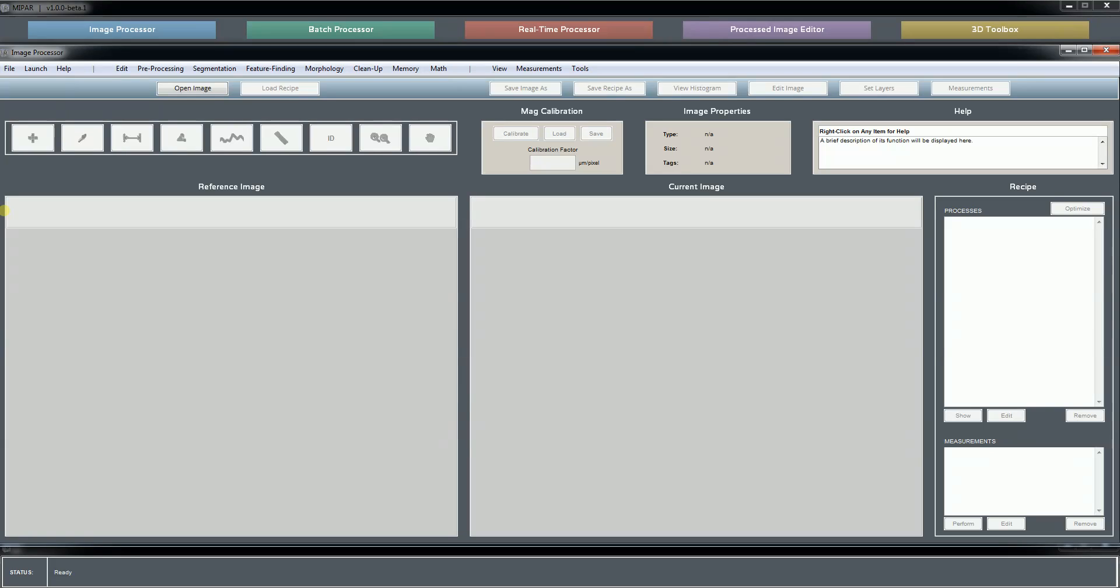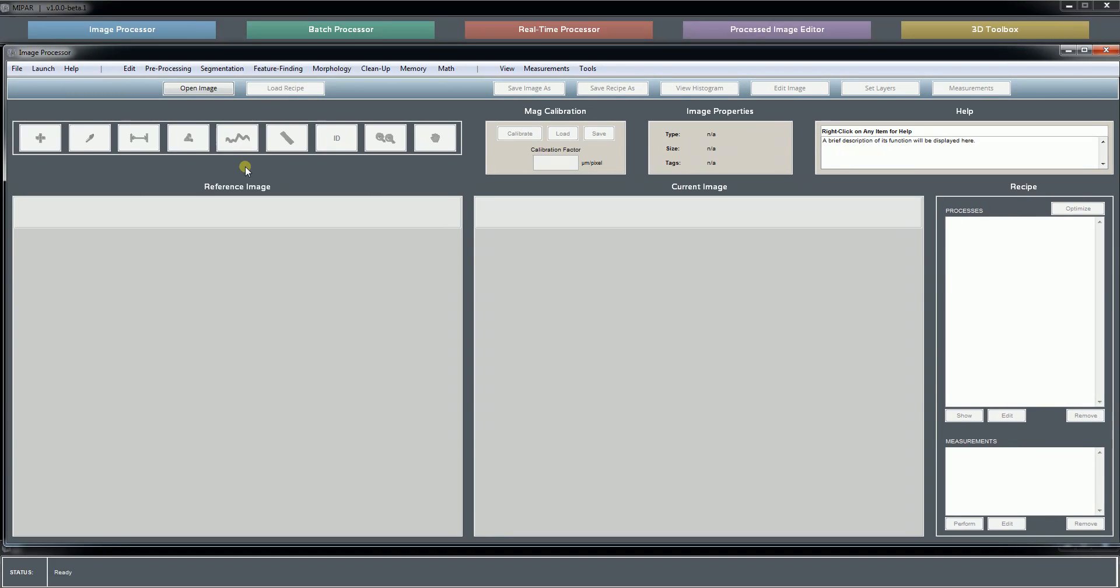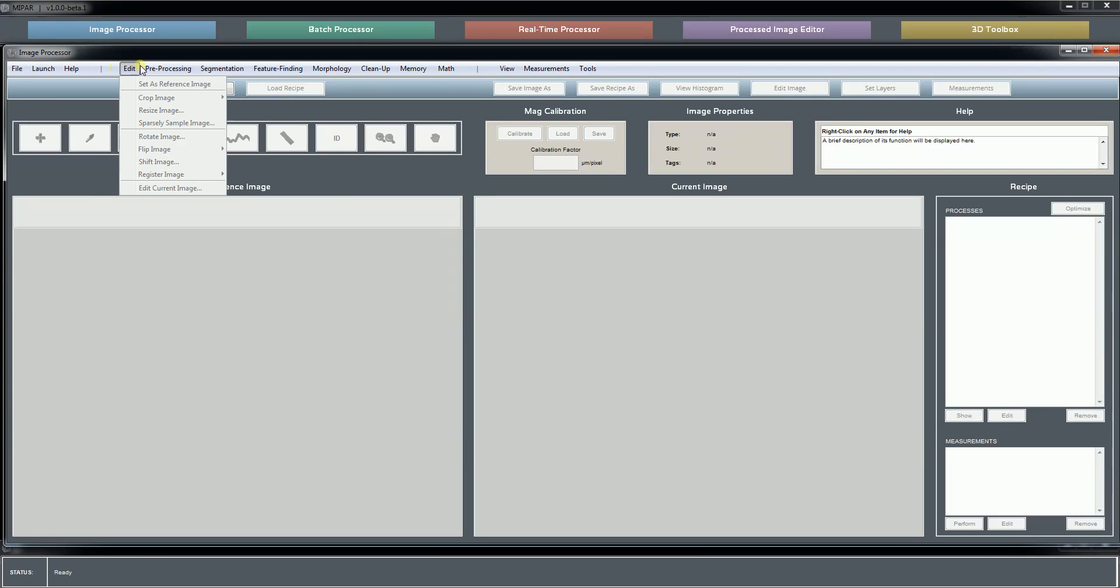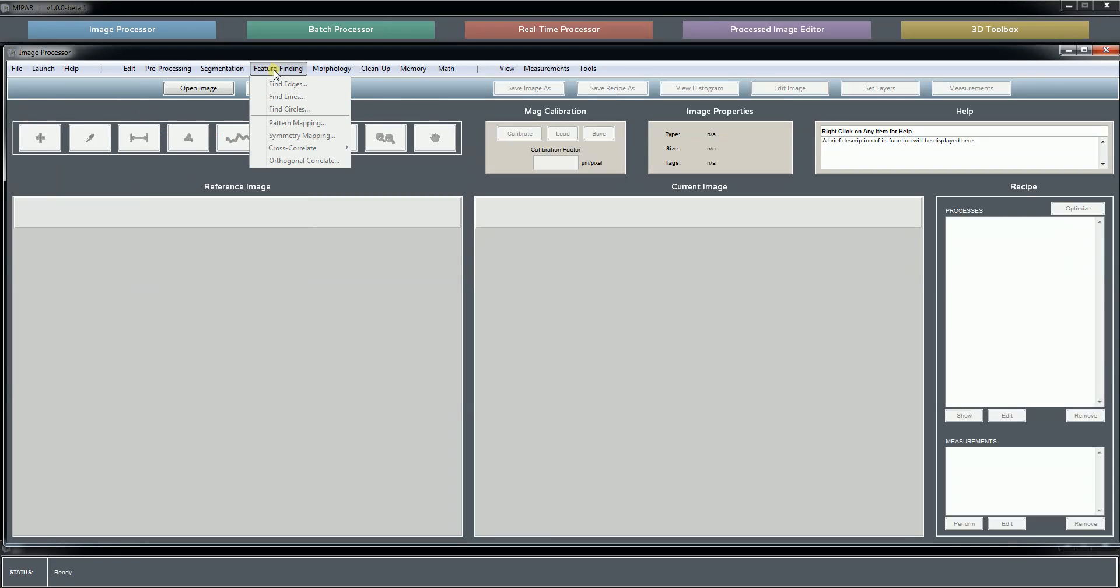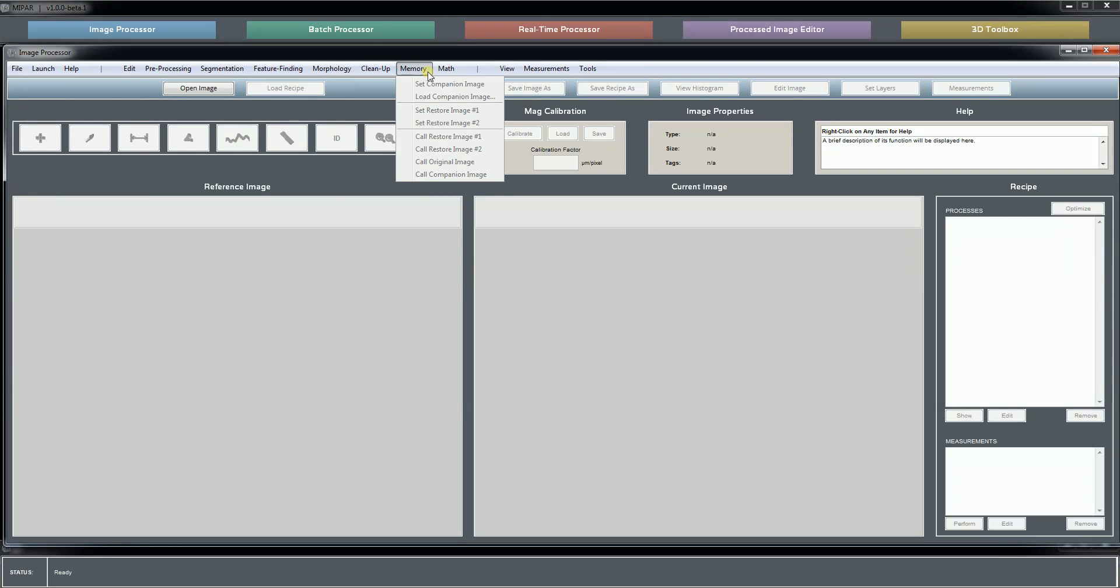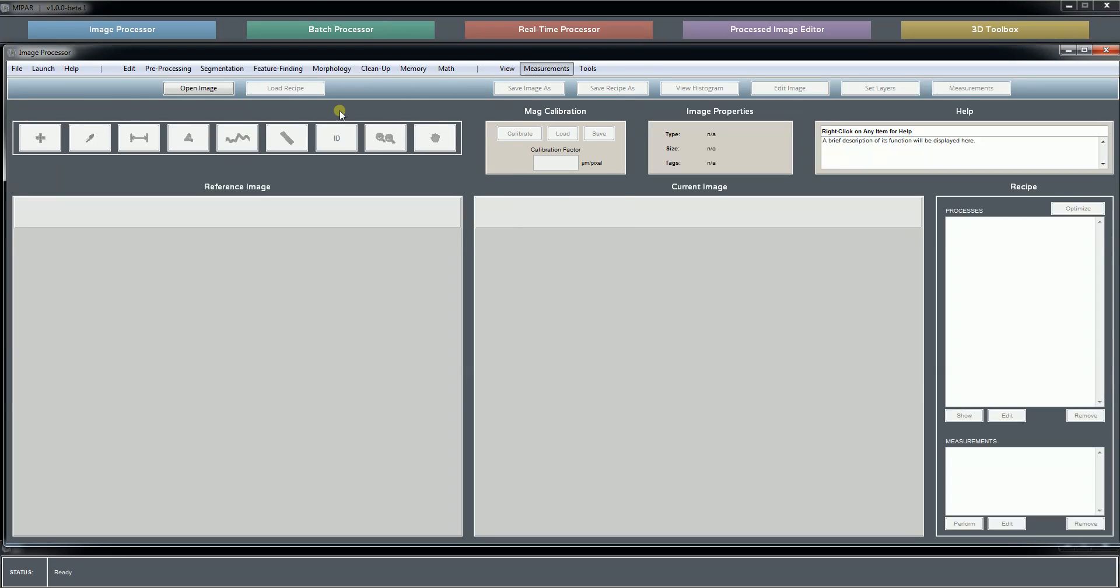Let's launch the image processor. This is where most users, I think, will spend a good amount of their time constructing recipes, processing single images, and so on. You have your menu bar up top that gives you access to many features. A lot of these will be covered in the future tutorials and the ones already present on the website.